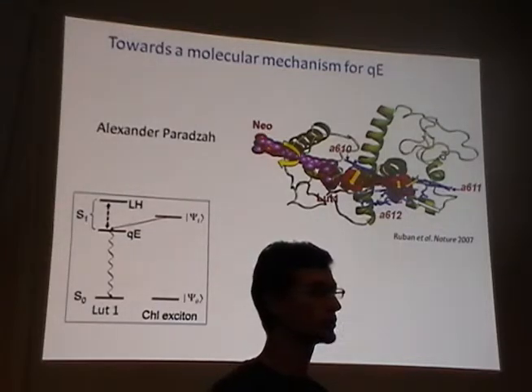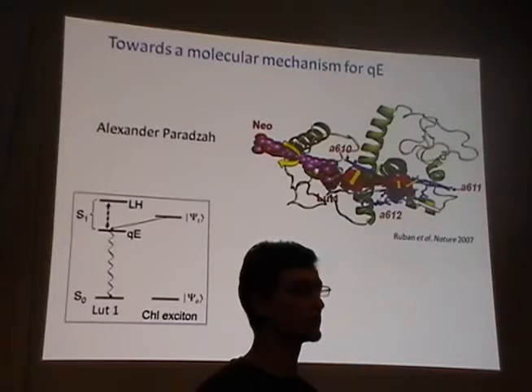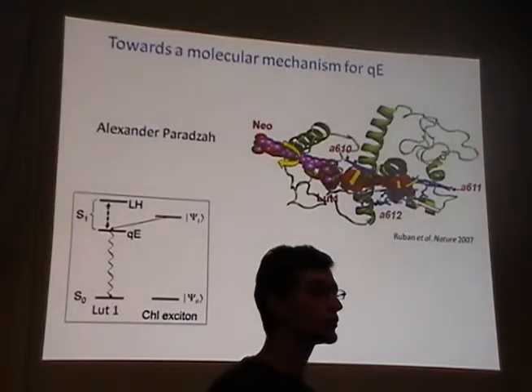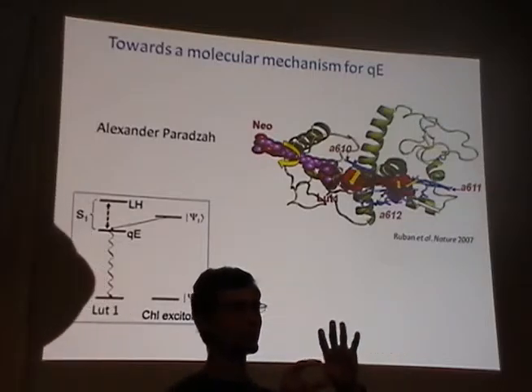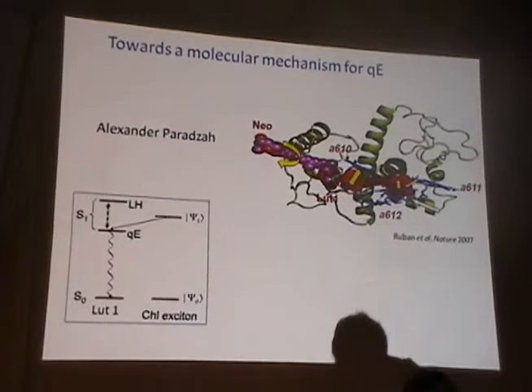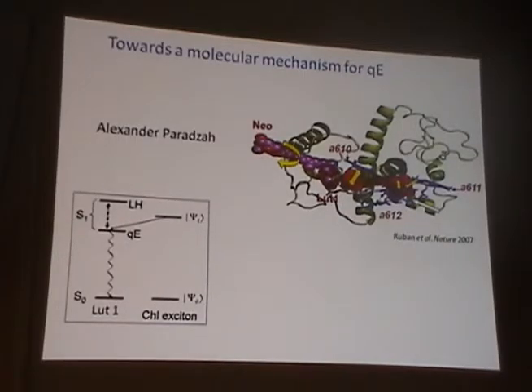Yeah, that's another quite fascinating experimental technique I actually wanted to include, but then I saw, well, it starts to become too much. So 2D, two-dimensional spectroscopy was used, which is a form of four-wave mixing spectroscopy. Some of you are familiar with that. Okay, and by using that, you can specifically look at relaxation of your population. So the relaxation of the population of your excited state is along the diagonals, and then you can also look for resonance among the different pigments, and these resonance terms are then the off-diagonal components.